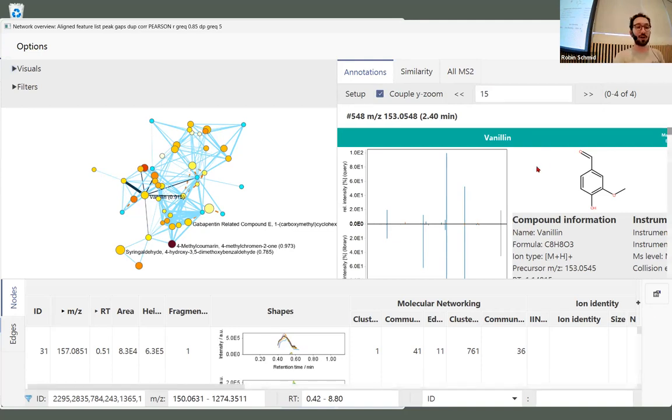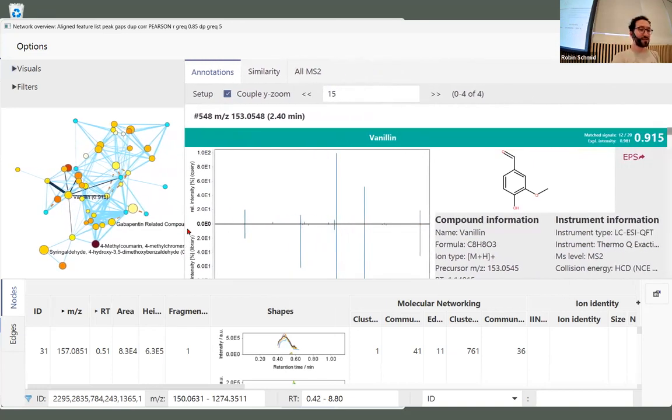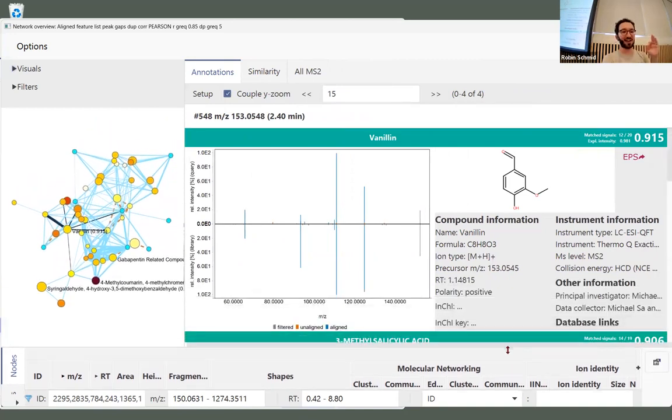And I only want to highlight some features that you can use here and that you can also use to understand, first of all, molecular networking as the concept for tomorrow, but then also explore the data set already. So in this view, we got the spectral library matches on the right side, and we did select the vanillin here. And on the left side, we have a network.